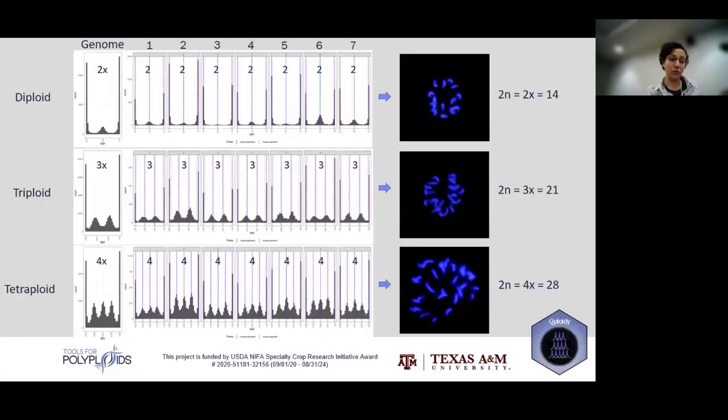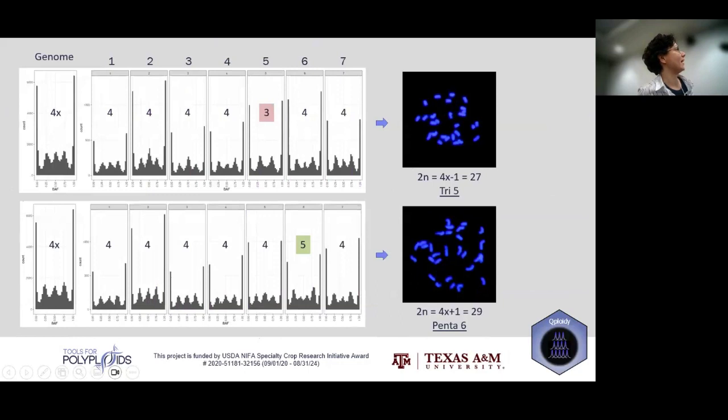And so far, okay, could be just my imagination. But then Oscar did the microscopy for some of the samples to validate the ploidy estimation capacities of the software, and it matched. And I was also inspired to do a logo with his pictures. And he also did the same for aneuploids, counting +1 or -1.